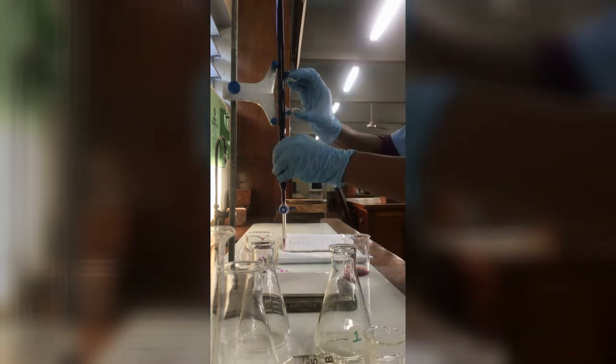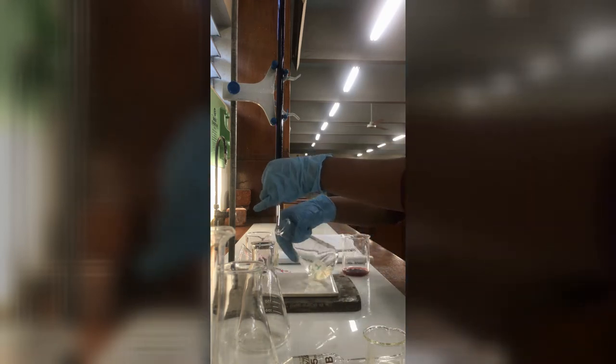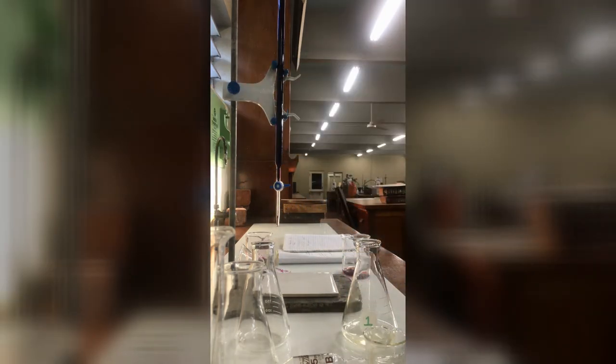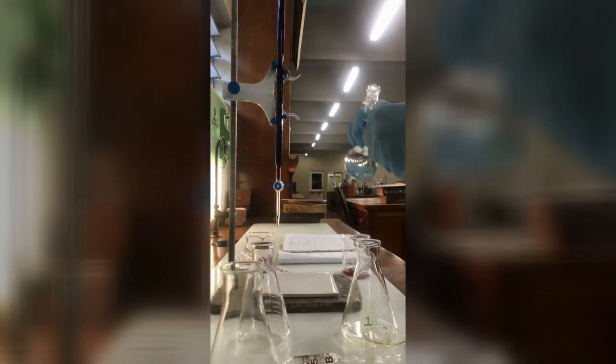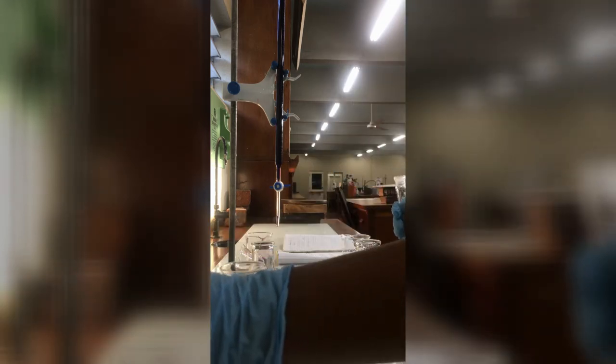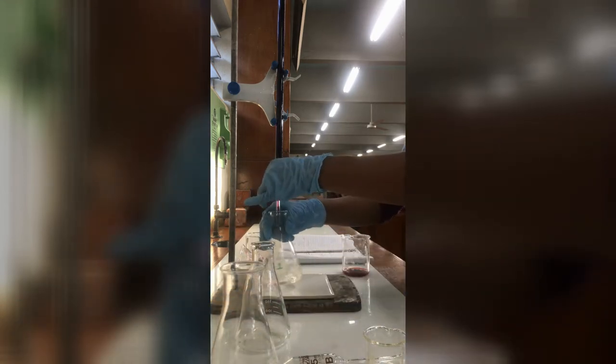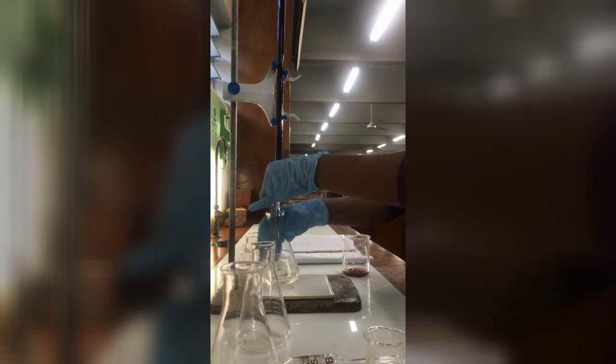Also observe how she operates during the titration. She swirls with her right hand and uses her left hand to operate the stopcock on the burette.